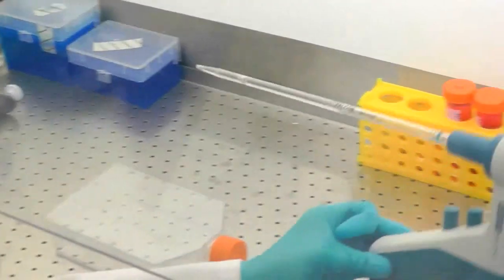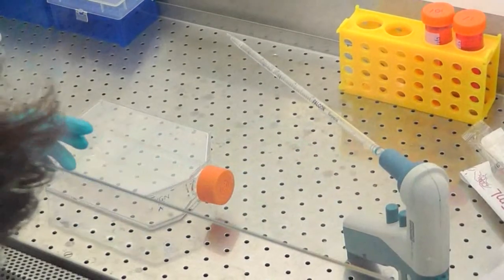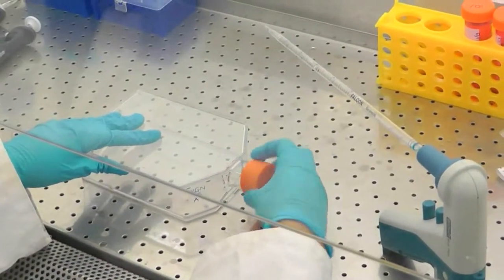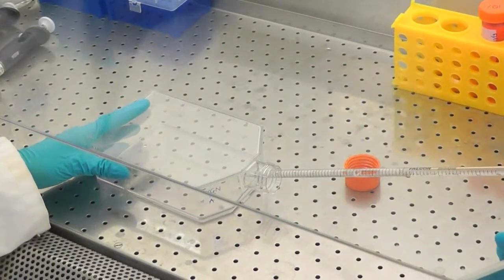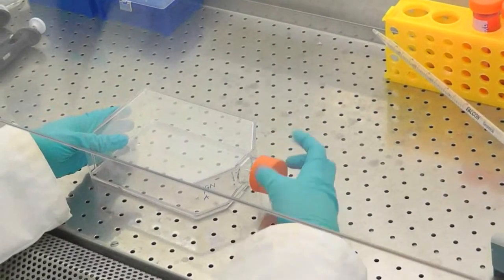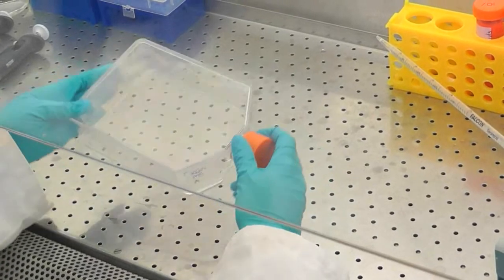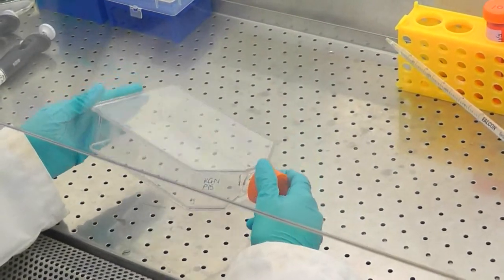This can be done using proteolytic enzymes such as trypsin, which disrupts both cell-cell interactions and cell-flask interactions. In this video, the researcher is using a non-animal based alternative called TrypLE Express. 5 ml of TrypLE Express is pre-warmed to 37 degrees Celsius in a water bath. It is pipetted into the flask. The flask is then swirled to ensure full coverage and placed in the incubator for 3 to 5 minutes.